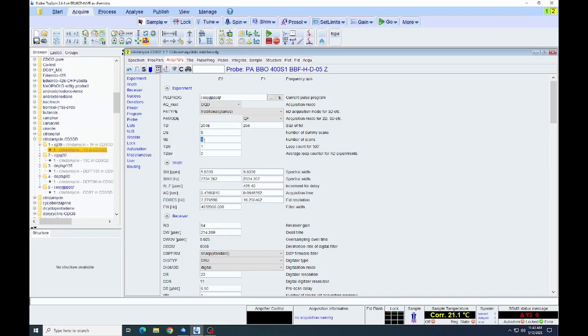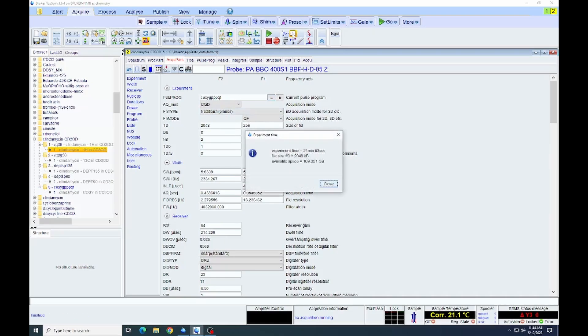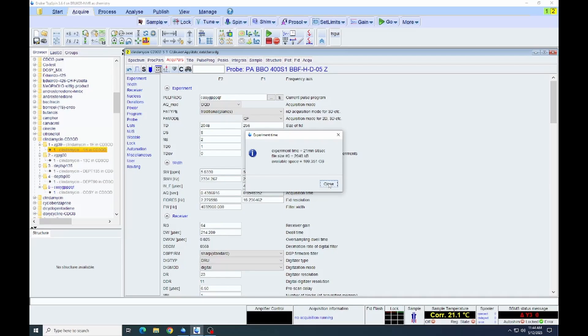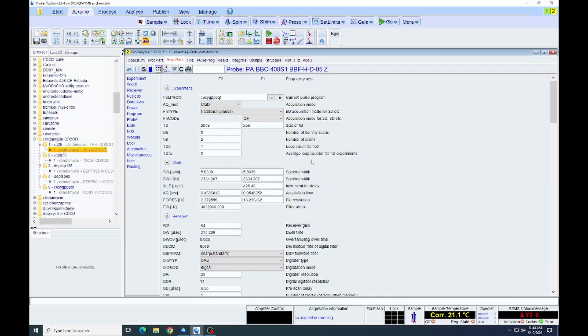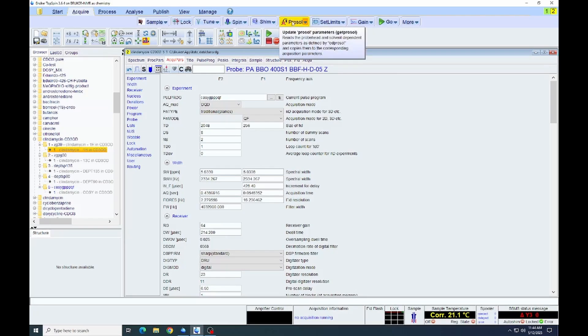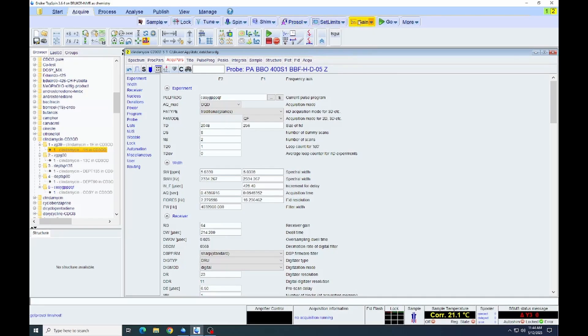We can always check the spectrum partway through and then adjust that if we need to. So I'm increasing the number of scans that we do for each increment. Again, checking the time. Typically with a proton, one or two scans should be plenty. Unless it's very dilute, you might want to increase that more. If it's fairly concentrated, you probably will get a good spectrum with just one. We'll click the prosol and then set gain and go to actually acquire the spectrum.